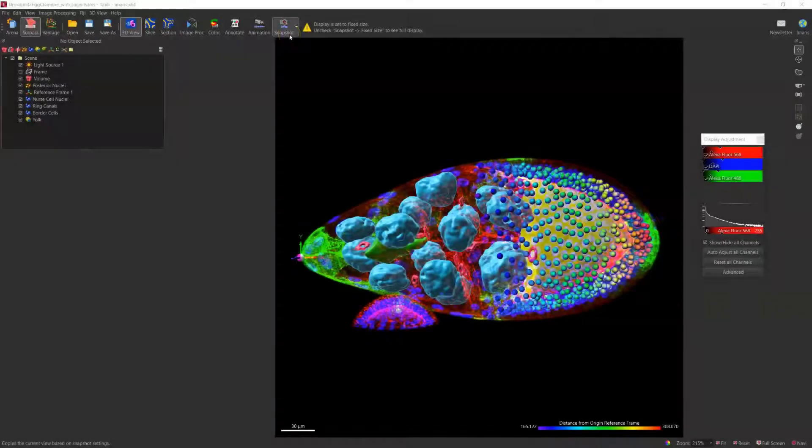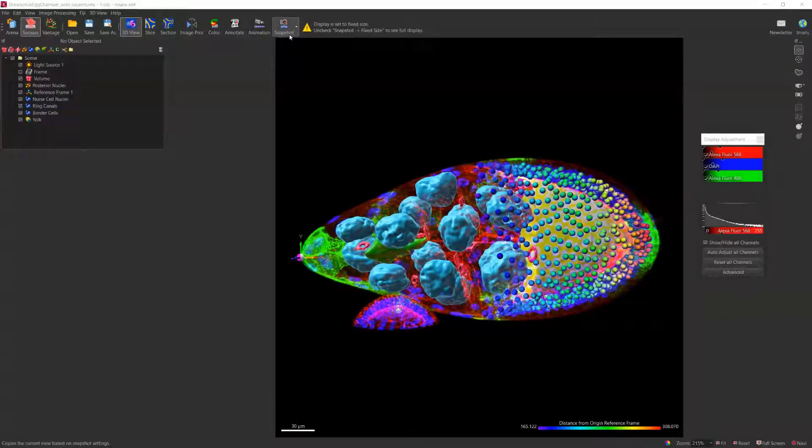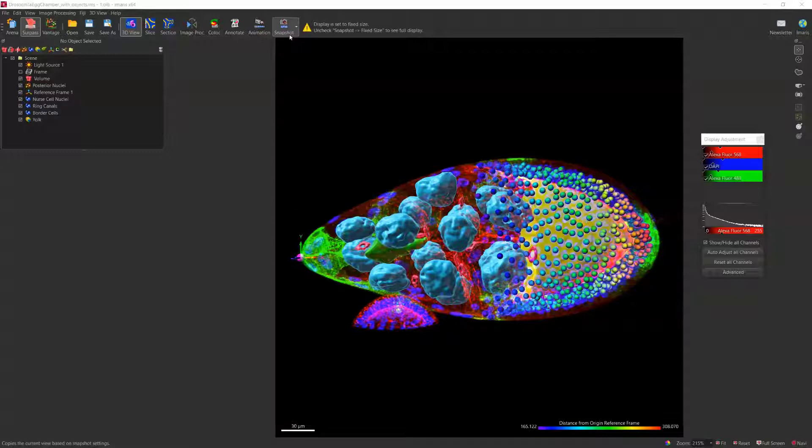One of the most crucial parts of preparing for publications or presentations is to have high-quality figures. To achieve that, Amaris provides a one-click snapshot solution that can generate the output image that captures what you see on the screen with specified dimensions.